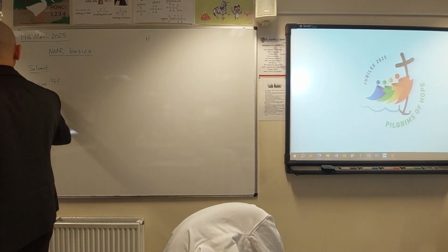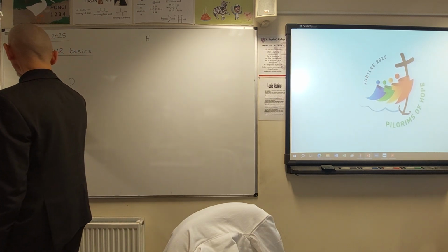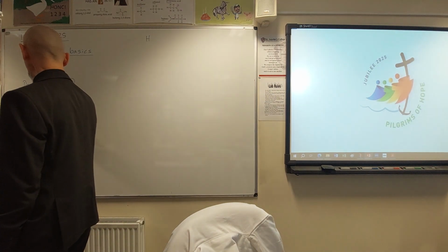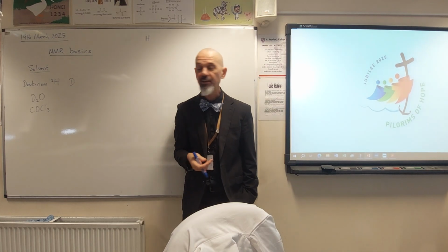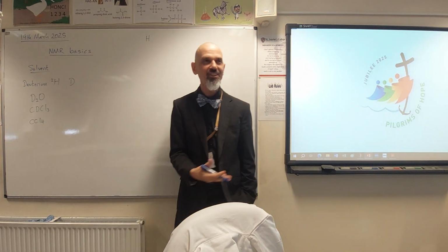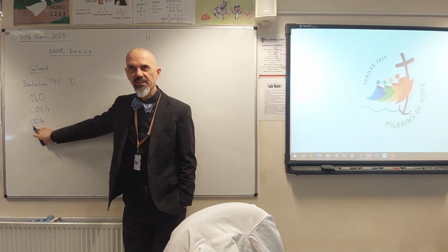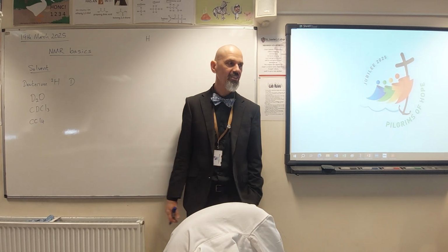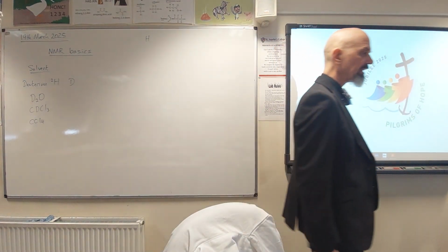The symbol, by the way, for deuterium is D. So that gives us an option of using D2O if it dissolves in water, or CDCl3, which is a deuterated form of trichloromethane, or indeed just CCl4 if it's non-polar. It has to dissolve in that particular solvent. That's why you need a range. So you've got a non-polar solvent for alkanes and benzene and things, and you've got the standard polar solvent of water or D2O, and then CDCl3 is kind of in the middle.